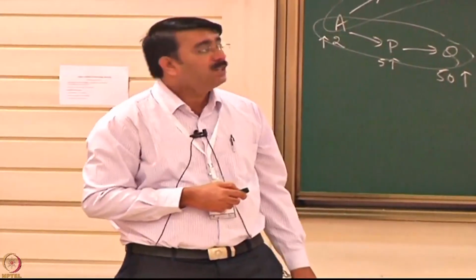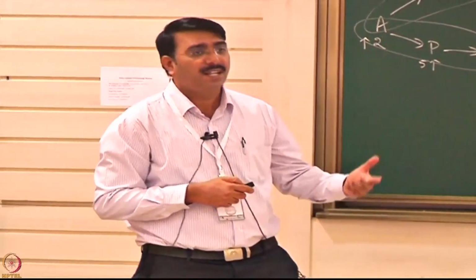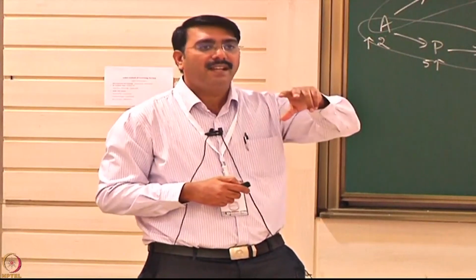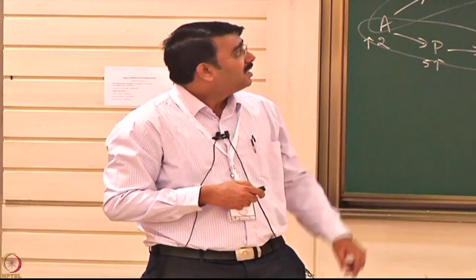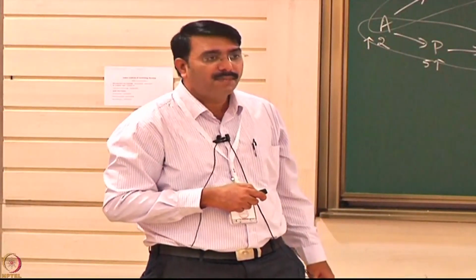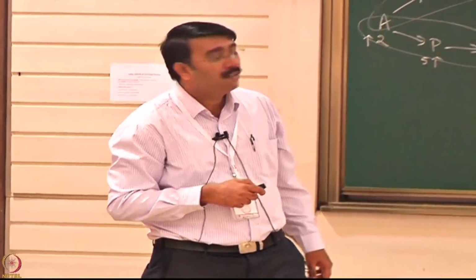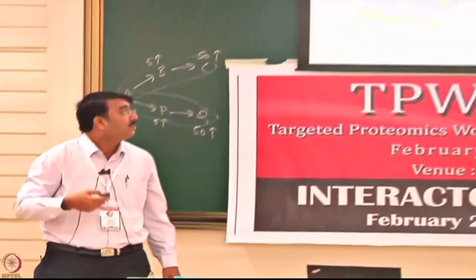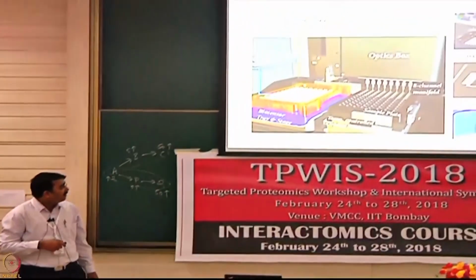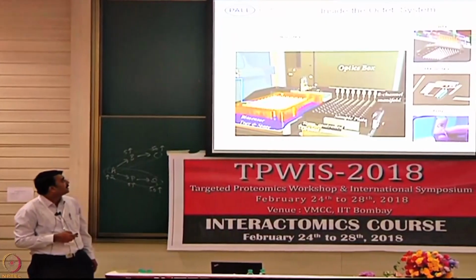When it comes to high throughput, we have different channels. In SPR, there are 4-channel and 2-channel instruments, where the 4-channel means you can pass 3 analytes and 1 acts as a reference. Here we have an 8-channel instrument, so 8 interactions you can measure simultaneously. That's where the throughput comes. We have a 96-channel instrument, where 96 interactions can be performed in one go, and a 16-channel instrument, where 16 interactions can be performed in one go. We have a single-channel also, and a 2-channel instrument.